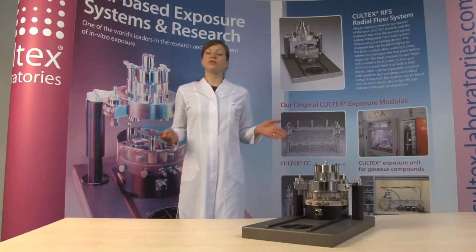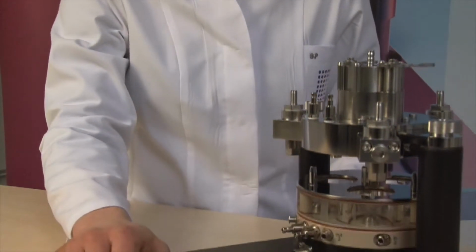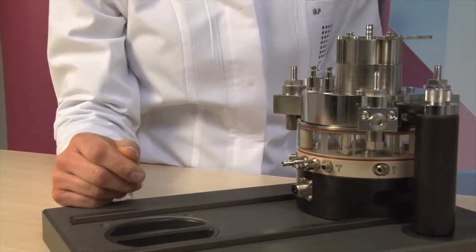We can offer you individual solutions for your projects. The CULTEX RFS gives you a variety of possibilities to carry out in vitro studies in the field of inhalation toxicology. You obtain reproducible results in a convincing good quality.